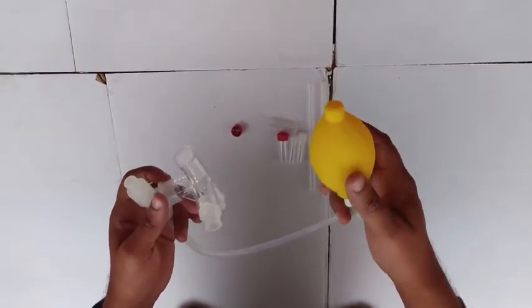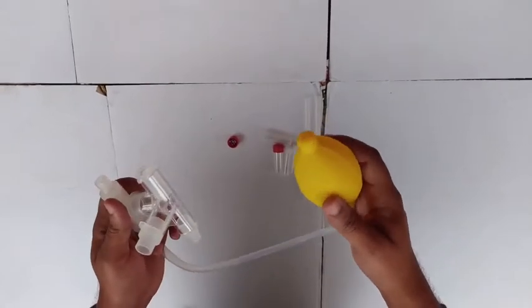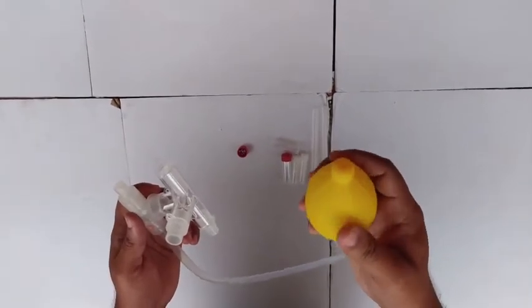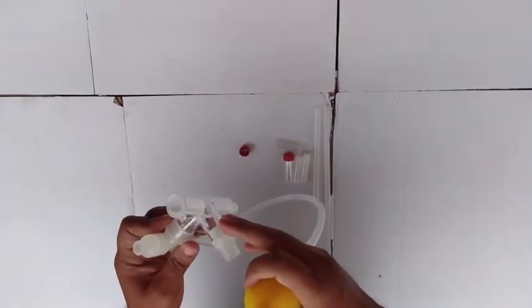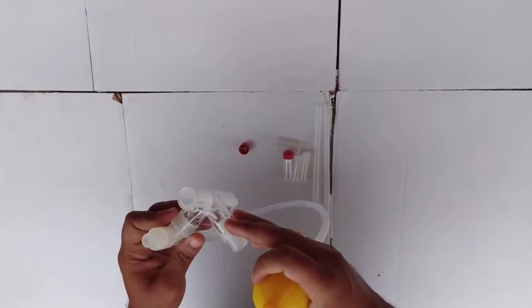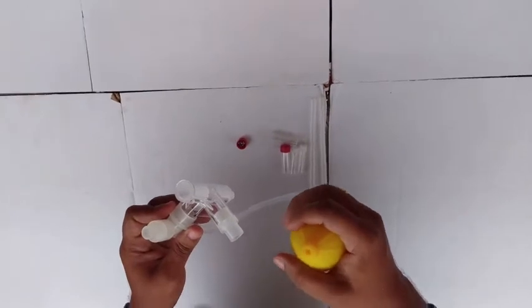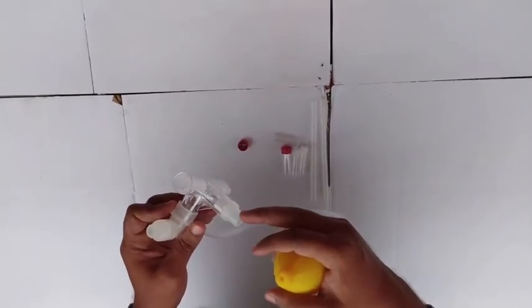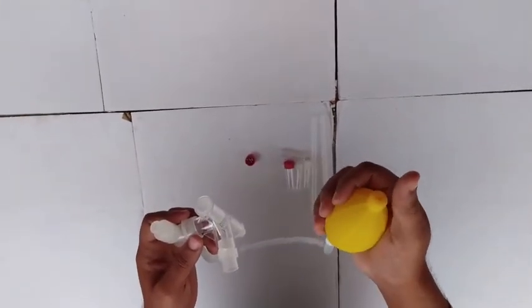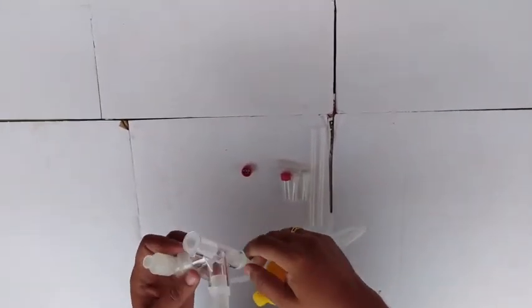Welcome back guys. Today I will demonstrate how to use a semi-automated insect aspirator — this is a bulb-based aspirator. It is semi-automated and does not require any battery power to collect insects. You also don't have to suck the air to create negative pressure. The tip of the aspirator is used to collect the insects. Pressing this yellow bulb creates negative pressure at the tip, which sucks the insect in and then releases it into the collection vial.